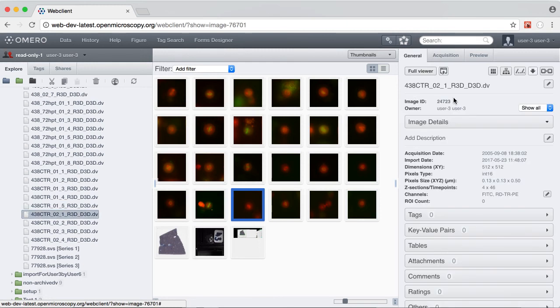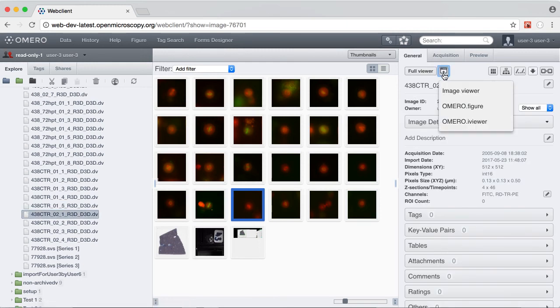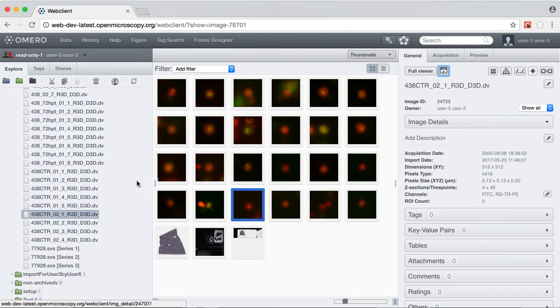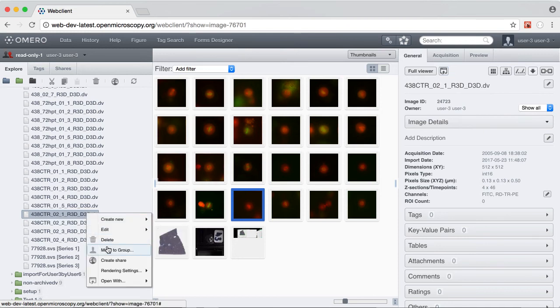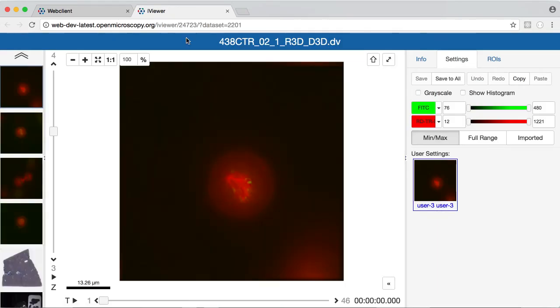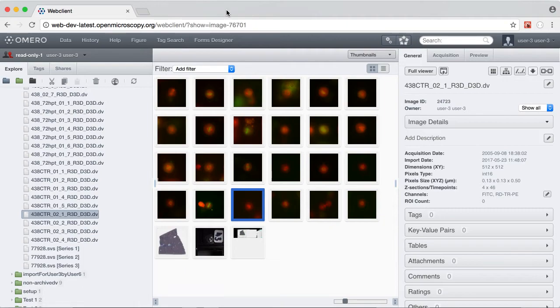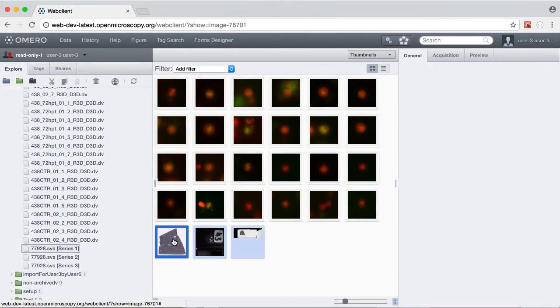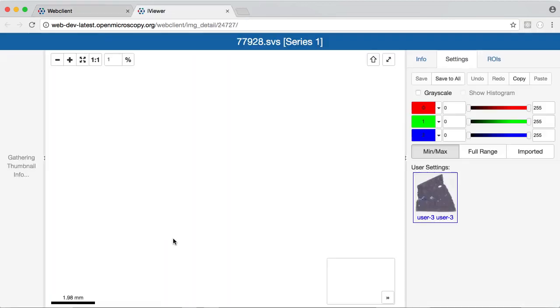For a selected image, I can access it via the open with menu at the top here, iViewer, or I can see the same menu by right-clicking on an image, open with iViewer, and this will open in a new tab. If the iViewer is configured as your default image viewer, you can simply double-click on an image.